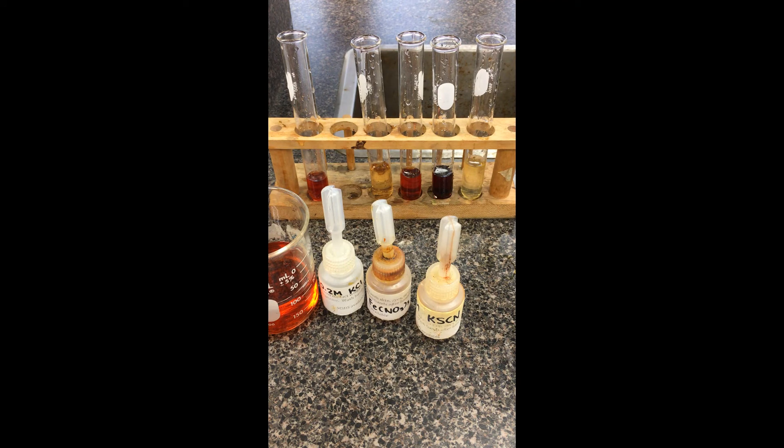Noting down those color changes, you're going to be answering some questions: which way has the equilibrium shifted, and what was the stress ion responsible for that shift? Thanks.